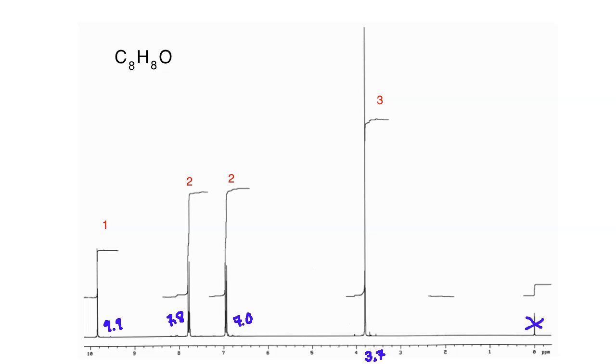All right, so just from a glance, you should be able to gather a couple of things here. First of all, the lowest ppm is 3.7, so we're dealing with electronegative type of stuff here. We don't have any sp3 hybridized hydrocarbon far away from electron withdrawing groups, because we would find those somewhere between probably 0.5 and 2. Now, what other information can I gather here? Well, between 7 and 8 is where I would find aromatics. So I will propose that I have a benzene ring.